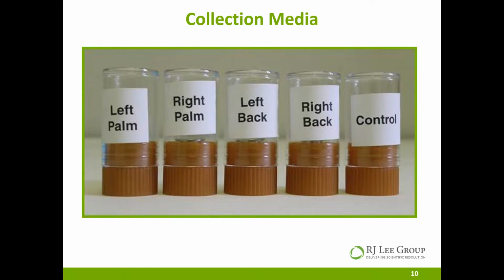And it's also possible that there was more gunshot residue on one hand and it got transferred to the other. So right hand versus left hand really has not a lot of significance to us, with the exception of just getting as much particulate off of the hands as possible.